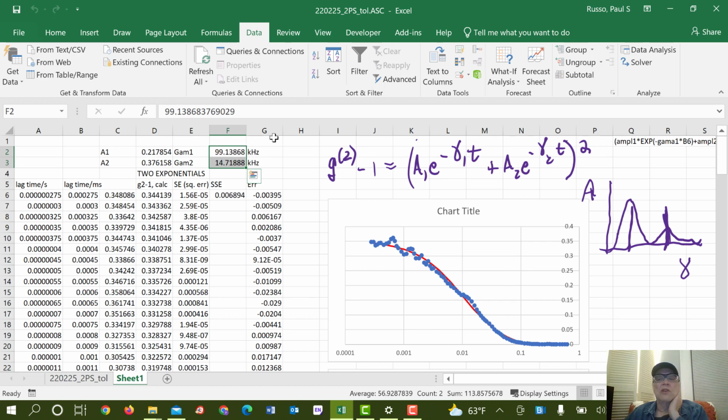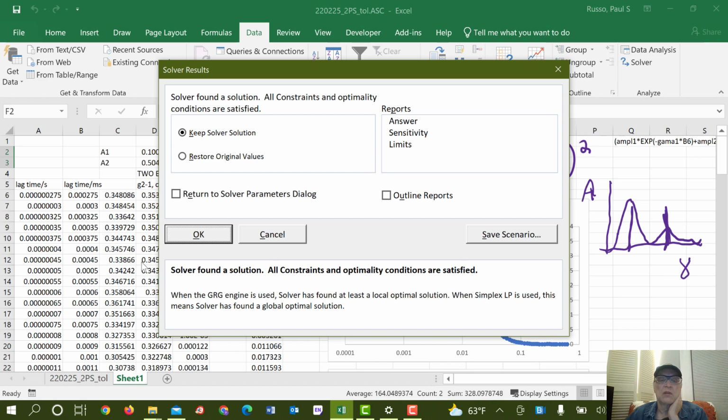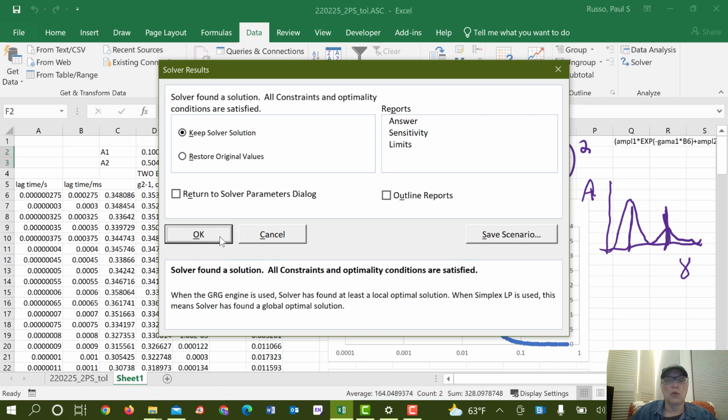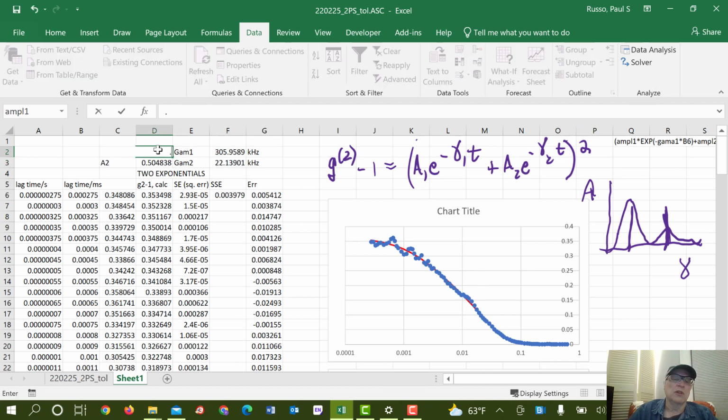Let's feed it these very things again and see if it's even really converged at all. Maybe just running it again helps. Yeah, it did. And we're getting back to kind of where we were, except that now slow is fast and fast is slow. All right, so you've learned a little bit. I wonder if we ran it one more time, if it would behave. And you'll see that in other packages, like the Origin package, you have the option to continue iterating. And so it basically has. Let's give it something ridiculous again.